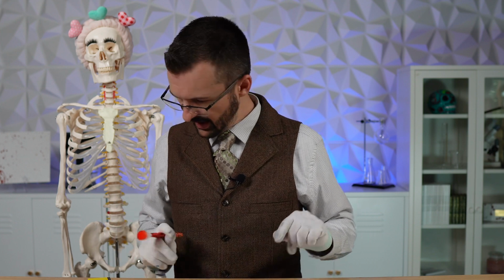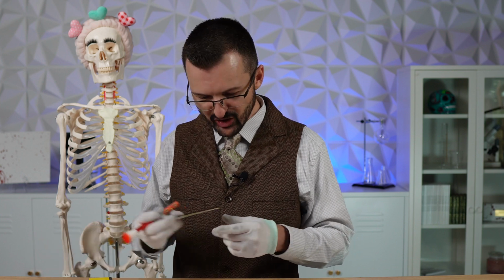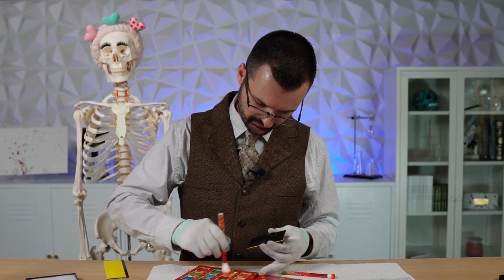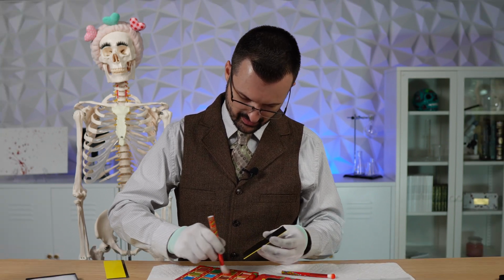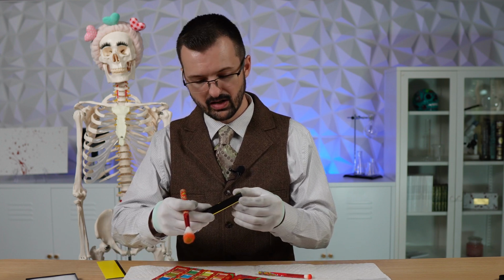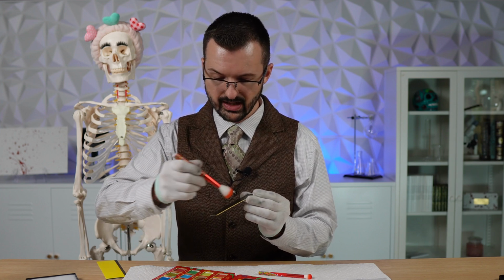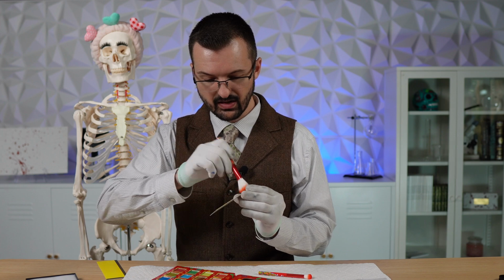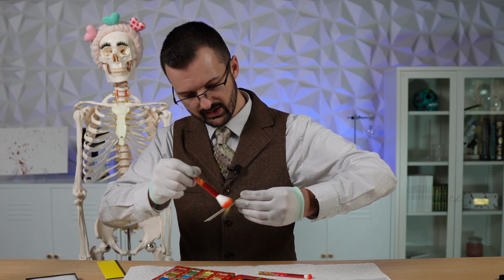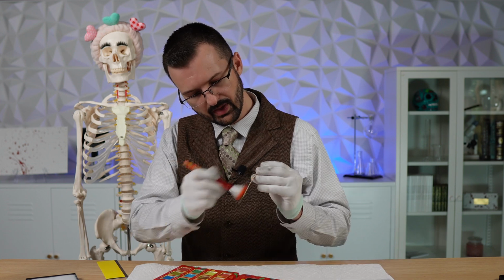We're gonna do a big brush, and we're gonna start on a black background because I want to see if this lime green powder works. All right, so we're going to take our surface that we have fingerprints on, and we are going to apply the same technique, going back and forth. Oh, I am getting powder everywhere. It's so fine. Maybe we need more powder.